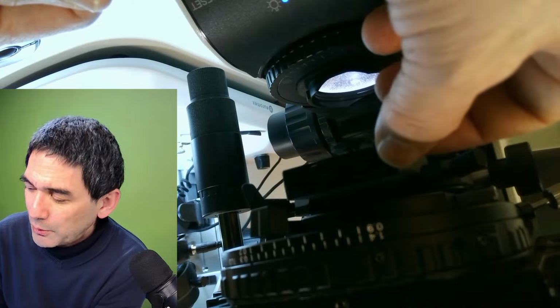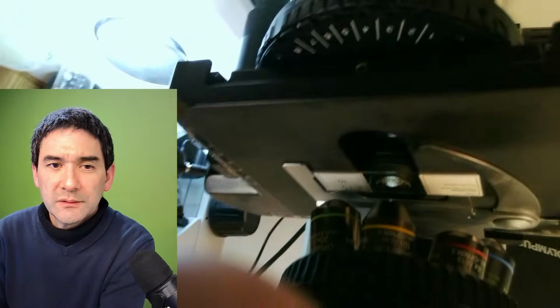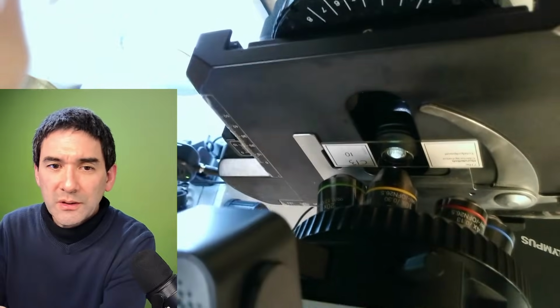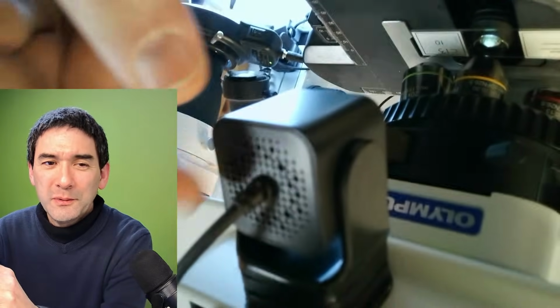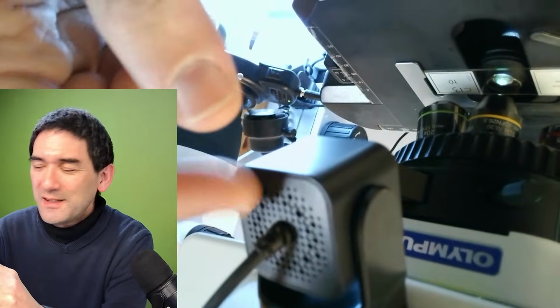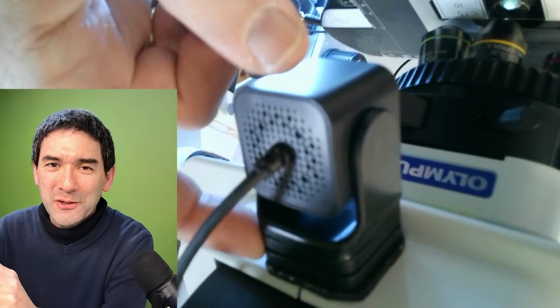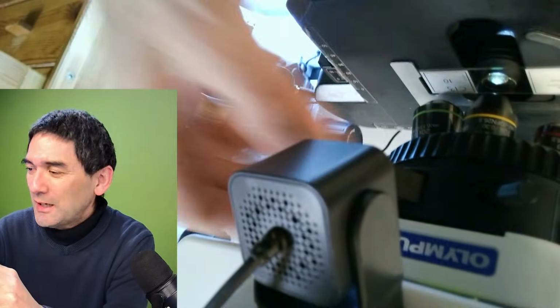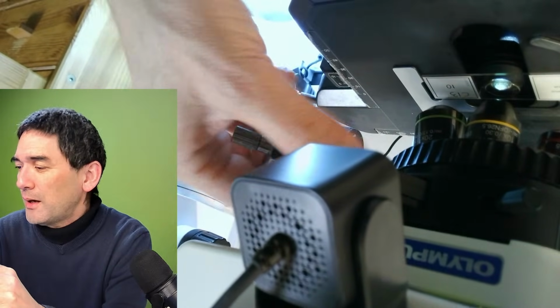So that adds the polarizing filter, and then there's another thing that I have to go up here, which you cannot see. By the way, this thing here at the top, I glued the camera on here so that you're able to see the stage, right? And there is this thing here that contains a prism.